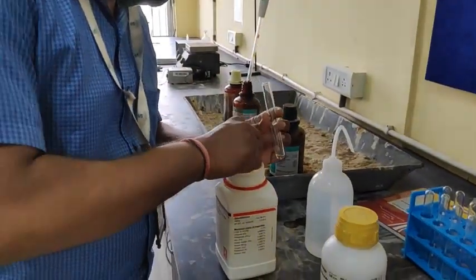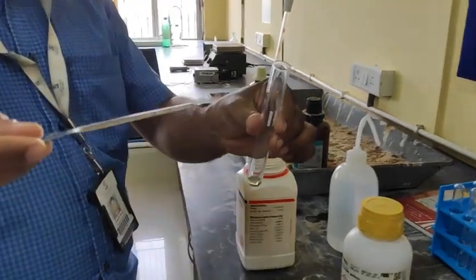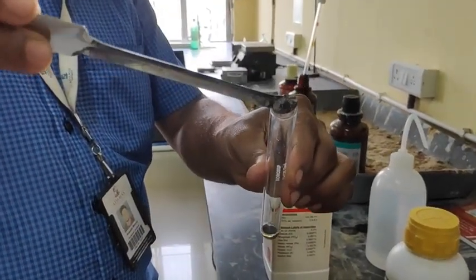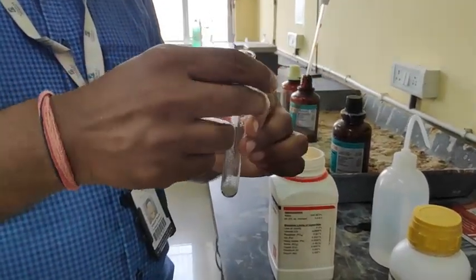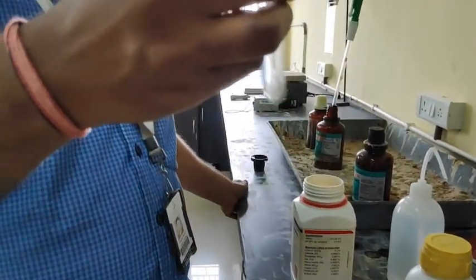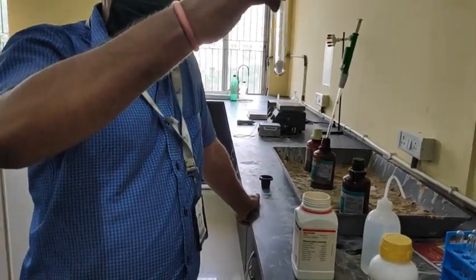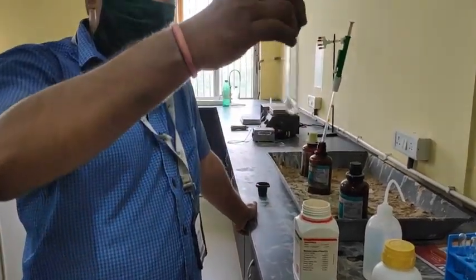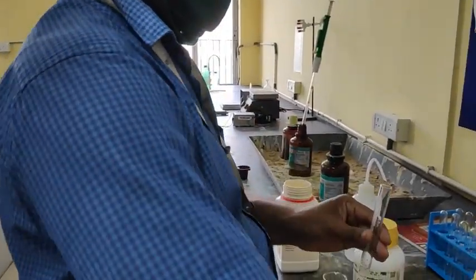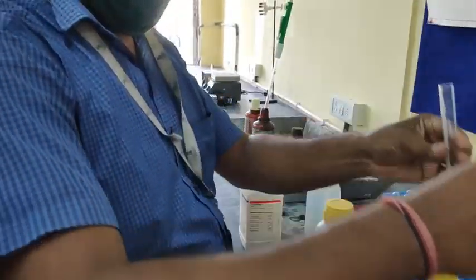Okay. So the next thing that we are going to do is the full saturation test, where we are adding ammonium sulfate crystals directly to the solution, and let's see what happens after the mixture. Sometimes, as these are biochemical reactions, they might take some time to go to their final result, and let's see if there is some kind of change.